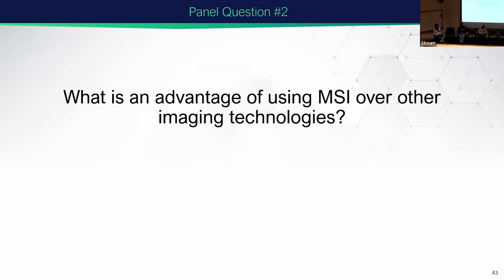So all these huge advantages come with disadvantages. NanoSIMS in particular works right at the edge of physical everything. Yeah. We're counting single atoms, and one little thing breaks and the whole thing goes south, and there's a lot of maintenance involved in just getting day-to-day data. Yeah, absolutely. And the breakdown voltages, you're limited by vacuum, you're limited by a lot of the fundamentals of the technique, so that makes a lot of sense.